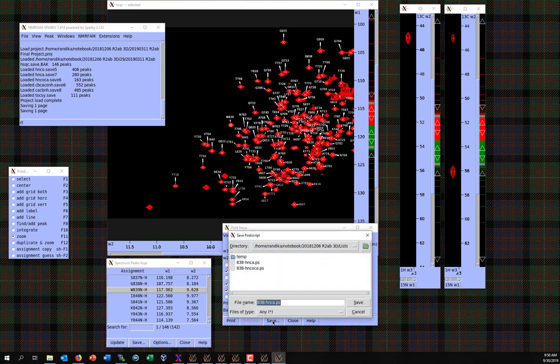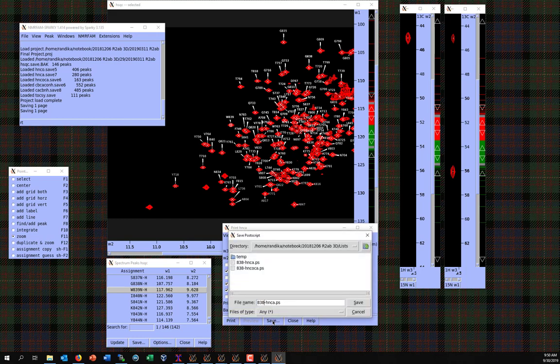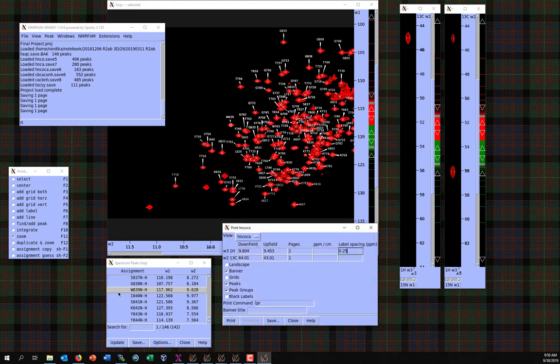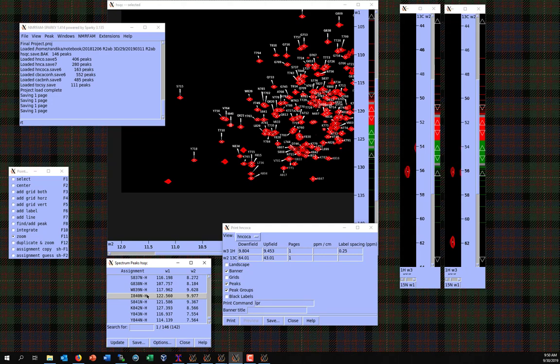So now we hit save, and look at this. It even kept the name for us. So we'll just keep 839.ps. Again, we'll do our HNCOCA. And really, that's all we're going to keep doing, is we're going to go up and do maybe five or six of these.